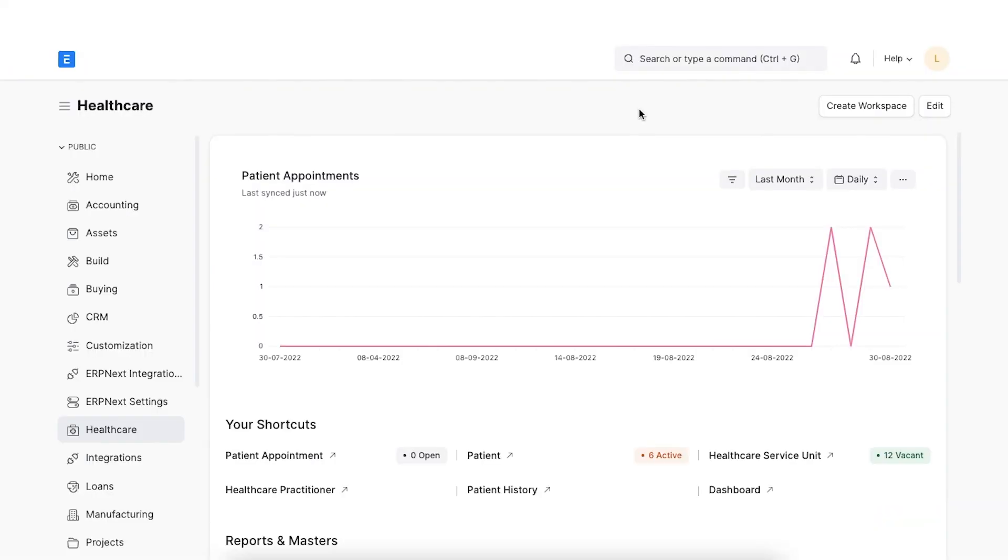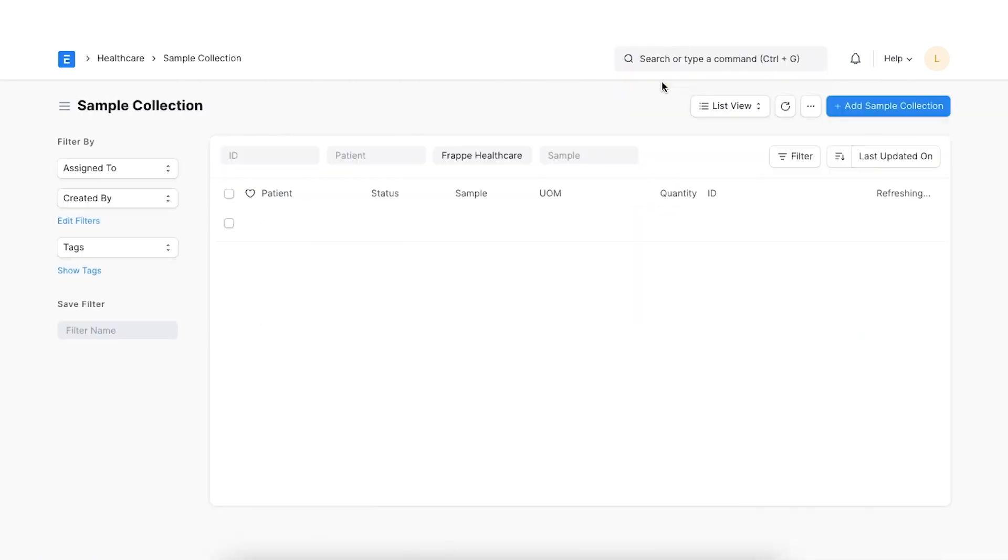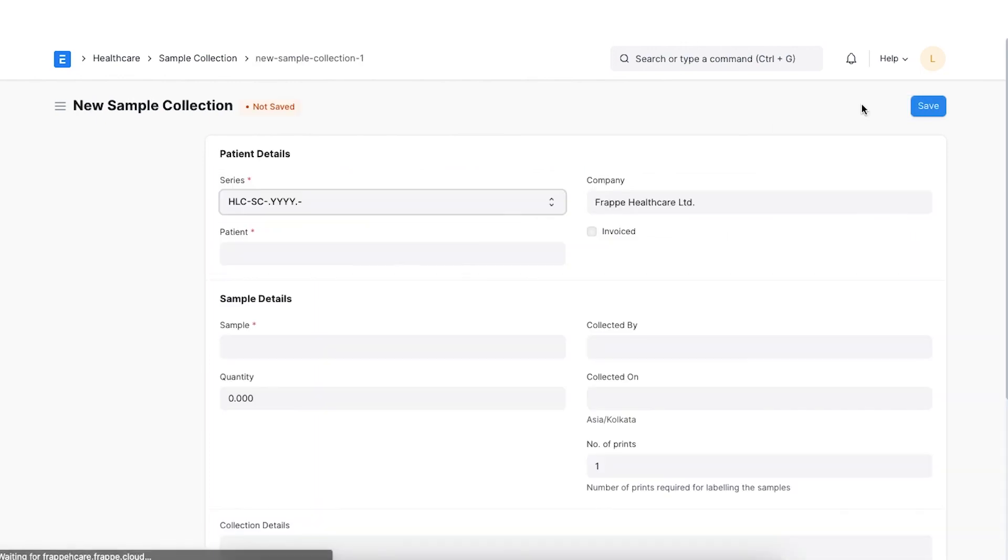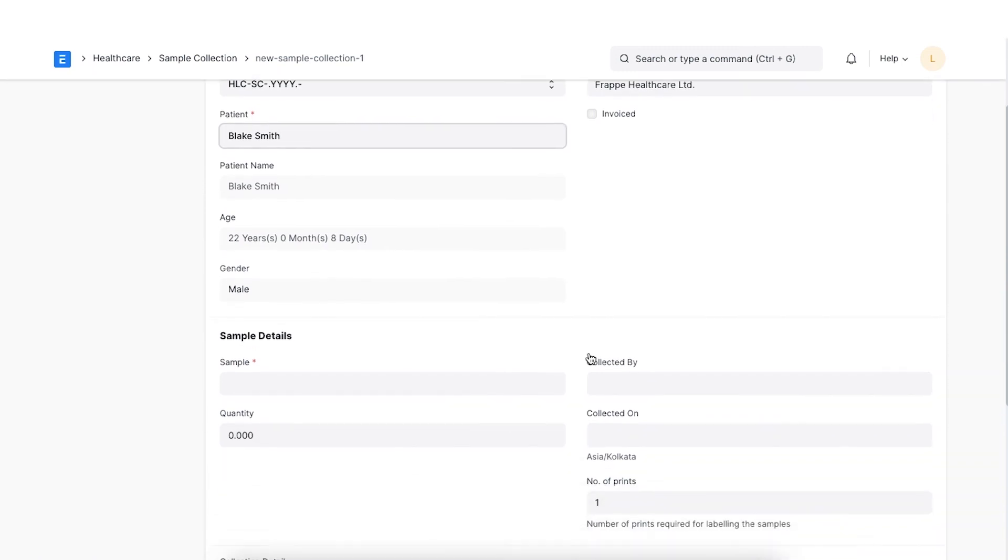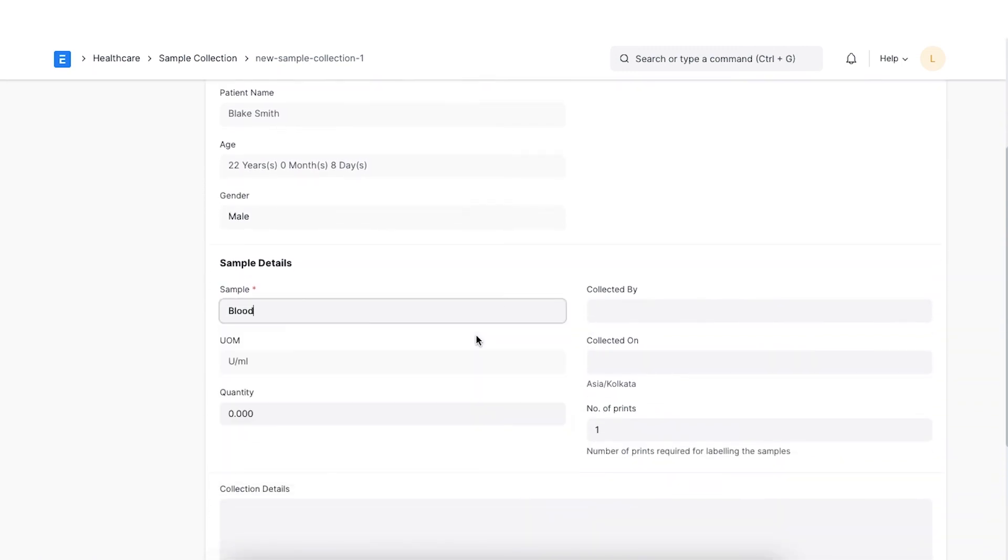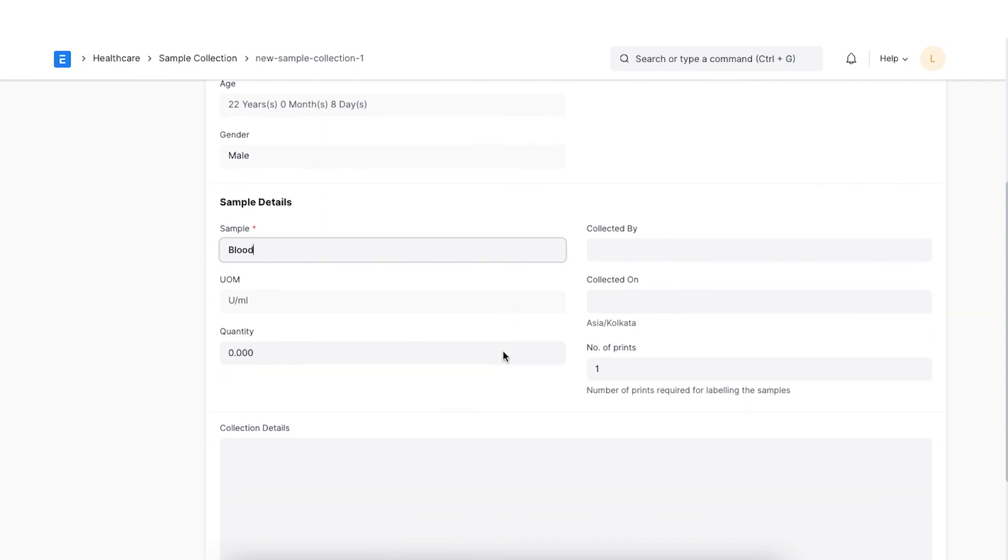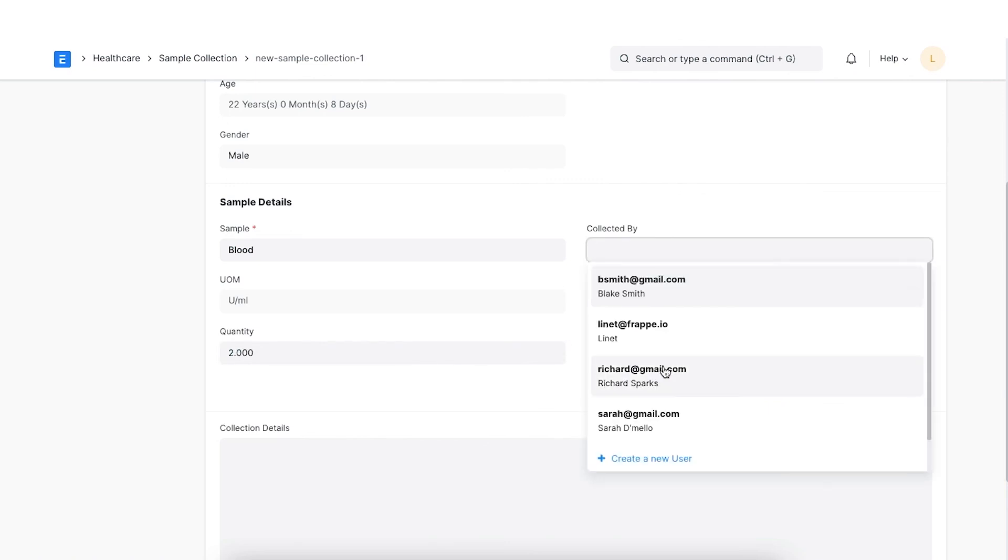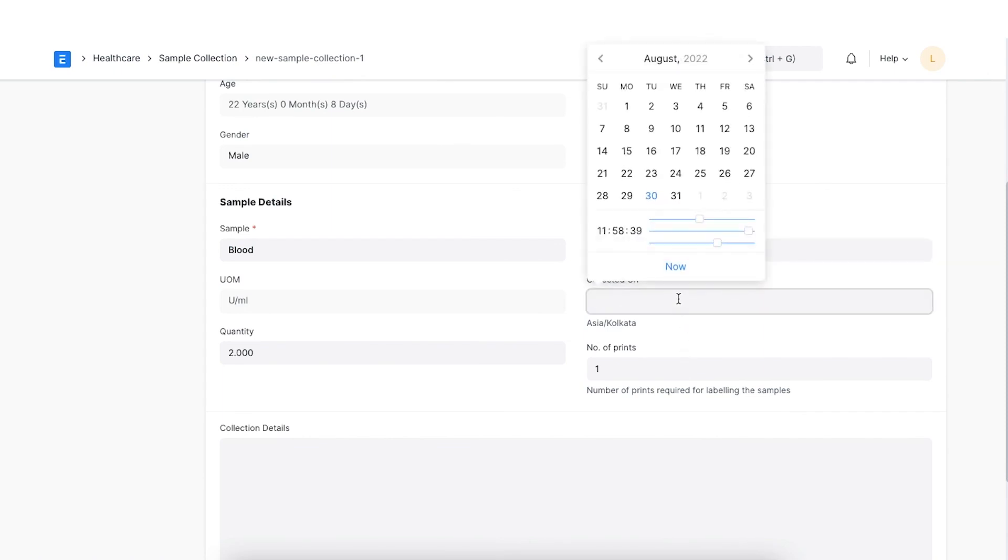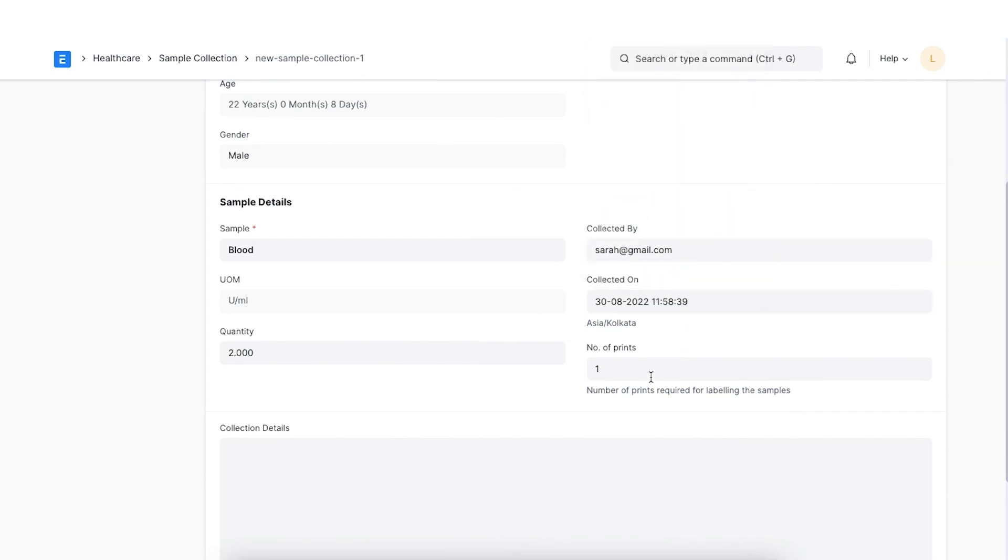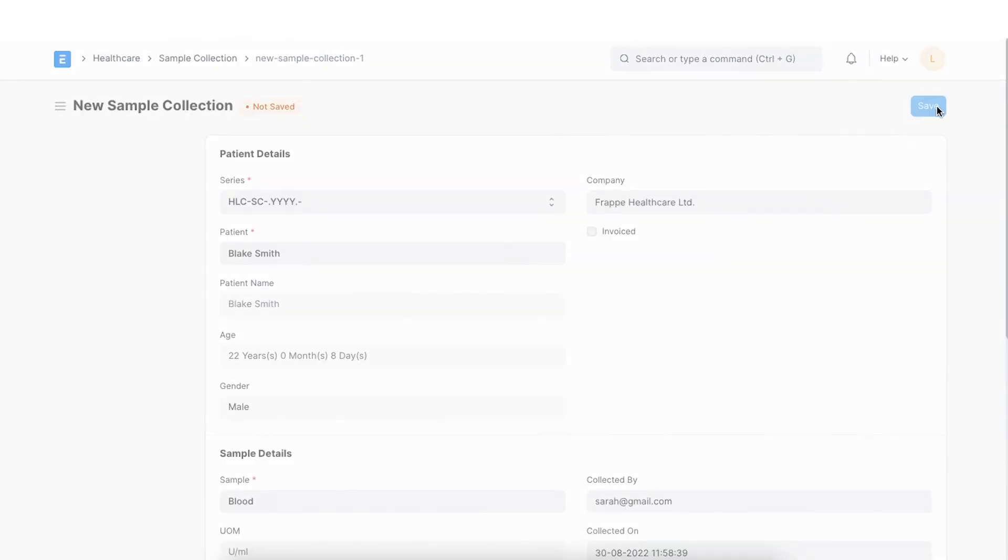Let's navigate to the Sample Collection Doctype and click on New Sample Collection. Once we enter the name of the patient, all the patient details will be auto-fetched. Select the lab test sample in the Sample field. Set the quantity of the sample collected. Select the user who collected the sample in the Collected By field. Set the date and time of sample collected in the Collected On field. Click on Save and Submit.